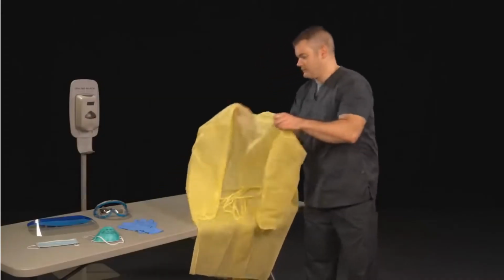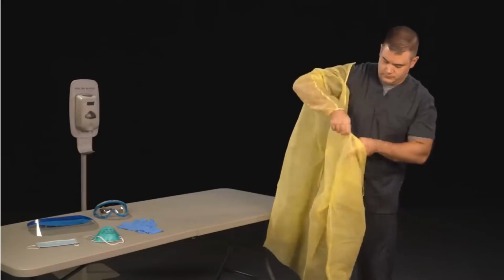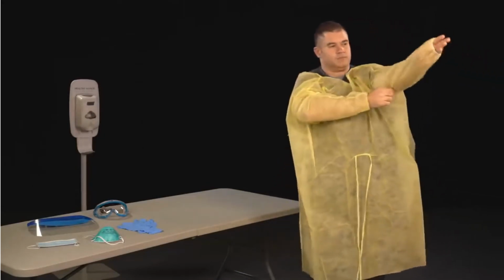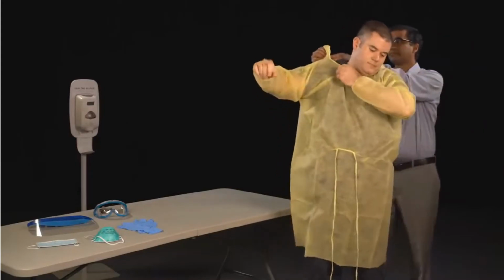Put on the isolation gown, tie all ties or snap all snaps. You may need assistance from another healthcare provider.